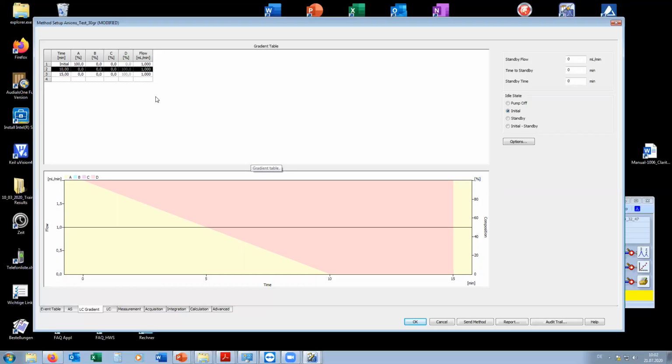Yeah, clear, but I'm not understanding exactly what I do. What is the LC gradient, what is the main function? I don't know exactly. Pump gradient, and a little bit of confusion in this program.